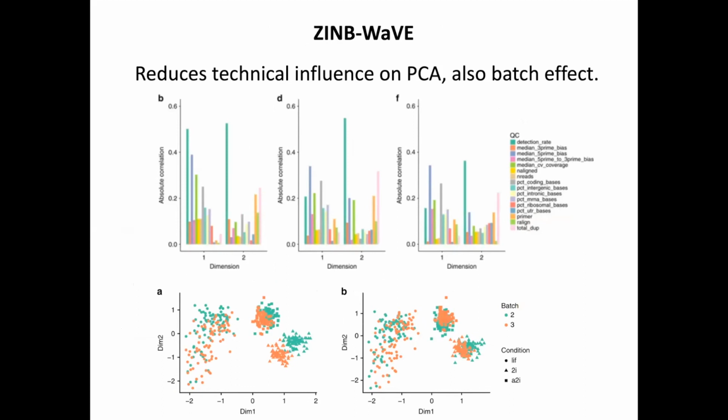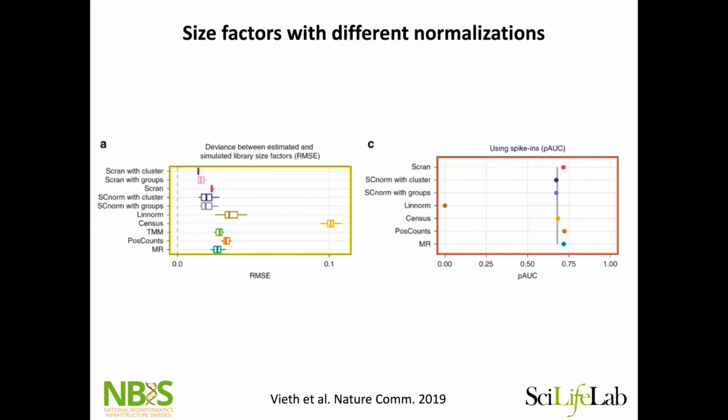And here's just a comparison. Here is a summary from one of these comparison papers where the size factors end up being very different depending on what method you use.